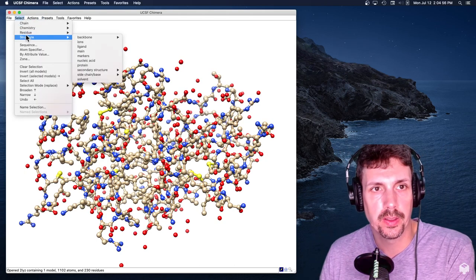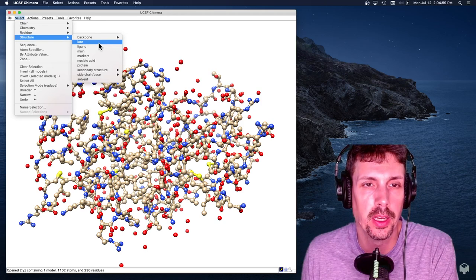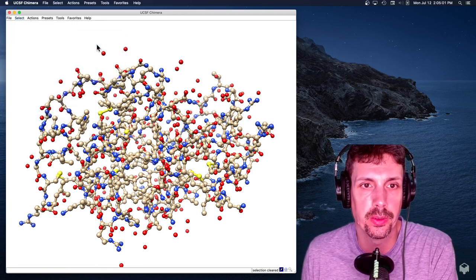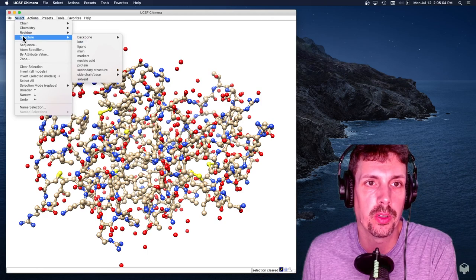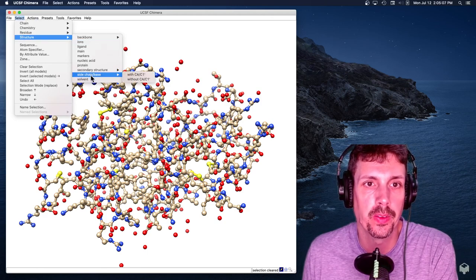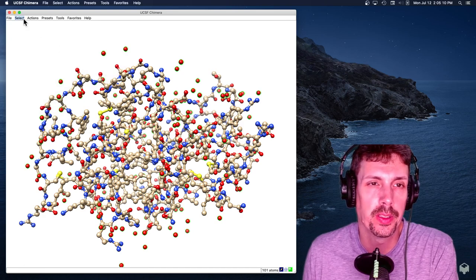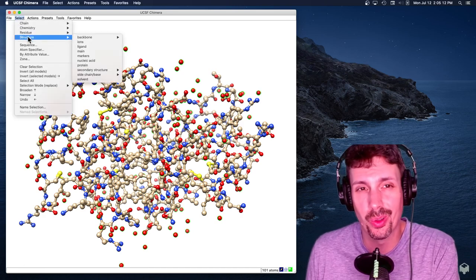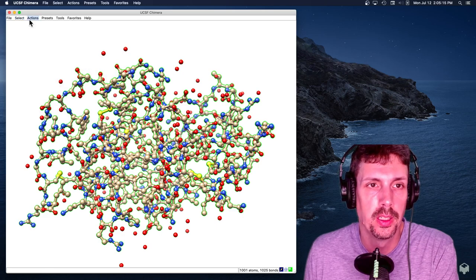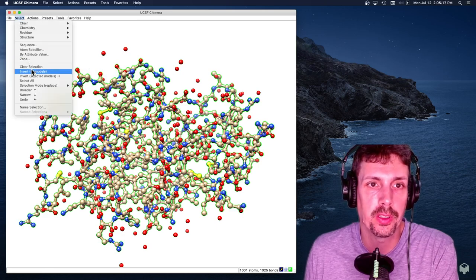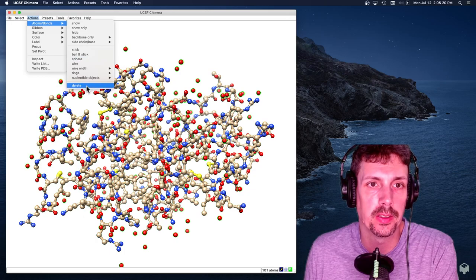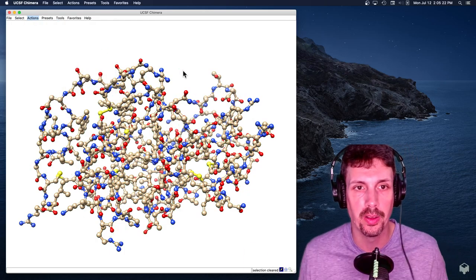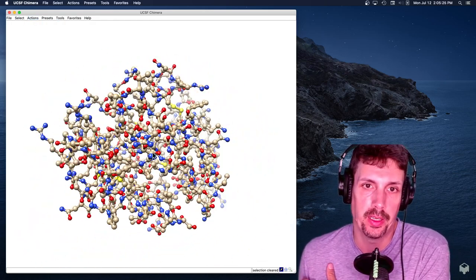There's a couple ways of doing this. I can go structure, and I can select ions, which will maybe select some of them. I can do structure and select solvent, which is a good way to do it. One of the ways I like to do it, because I know there's only protein in here, I'm going to select protein, and then I'm going to invert all models, and then I can go actions, delete. And so I've deleted all the atoms that are not protein atoms here.